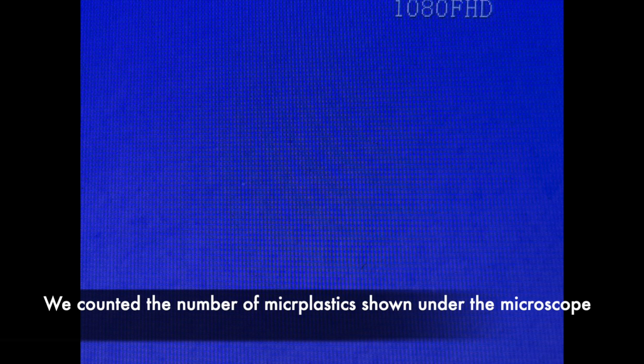Here's an image of what the microscope was showing us. It's kind of hard to see, but there are some dots on there that showed up as microplastics.